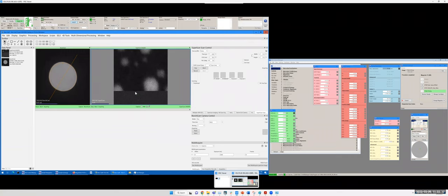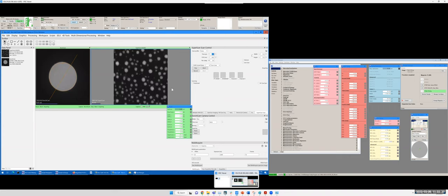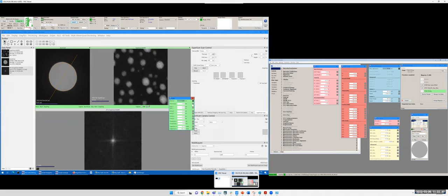So let's show some beautiful atomic images now. I'm looking at gold particles. I want to change the focus to show the lattice fringes. There are different ways of doing this. Some people prefer a large field of view like 64 and do an FFT, and then you can see the diffraction pattern if you are aligned very well, and tune the astigmatism based on those diffraction patterns to make them sharp.